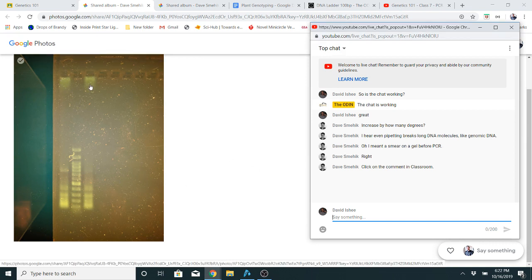So from here you can see a few things. For one, there's something very big in the well here. Sometimes this can be protein. I just swabbed vigorously with the NaOH. Okay. Yeah, that's what I usually do. When I take the swab, I just rub it all around my cheek, put it in the NaOH, and then just swirl. I just spin the Q-tip around and around until it gets kind of cloudy, and then I kind of squeeze the liquid back into the tube, but not with my finger. I just press it against the side of the tube and throw it away, and then add the Tris and go on. I've always had really good luck with that prep method with cheek swabs.